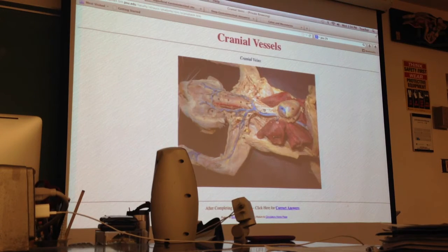So if we were to pin this one right here, the thyroid, remember, it's the one on top, it's wider, and it's shaped like a chevron. Those are some things to describe it. If we were to pin this and ask you for the structure or the cartilage, then we'd be asking for thyroid. Same for the cricoid. If we pin this and ask you to identify the cartilage or structure, we're asking for cricoid cartilage. Remember, it's just going to be the first cartilage after that thick chevron-shaped thyroid cartilage. After that, the rest of the cartilaginous rings we see are going to belong to the trachea.